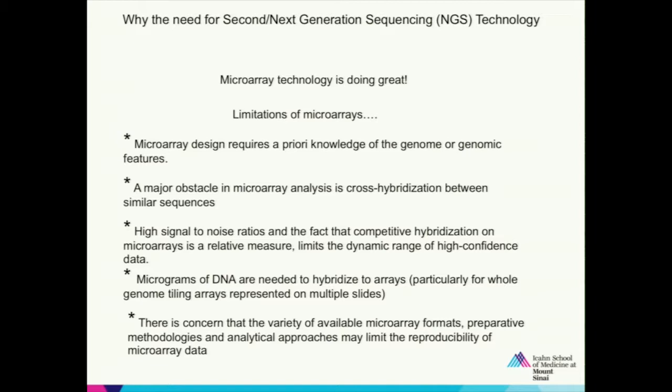Okay. There are limitations. And then there is a concern, again, that because it's hybridization-based, fluorescence intensities differ from experiment to experiment, site to site. So exact reproducibility becomes a problem. Conceptually, we'll get that there is an expression of this RNA, but how much? Lab to lab, there are different variations. So statistically, the standard deviation is very, very big. Okay? So these are all limitations.